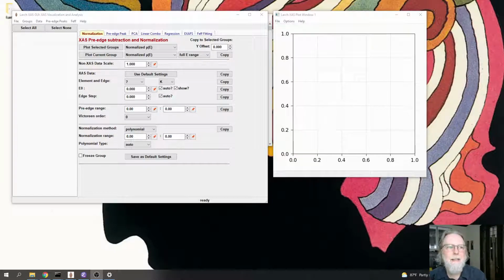For analyzing extended XAFS data, we use Feff calculations to simulate the XAFS scattering factors and then refine structural parameters such as near neighbor distance and coordination number to match experimental spectra. As a theoretical physics code, Feff is a pretty straightforward program to run to simulate XAFS, but using it well can still be one of the more daunting tasks for novices starting out with XAFS analysis.